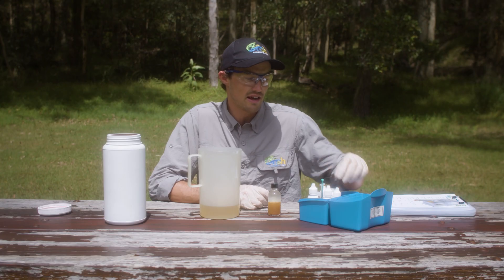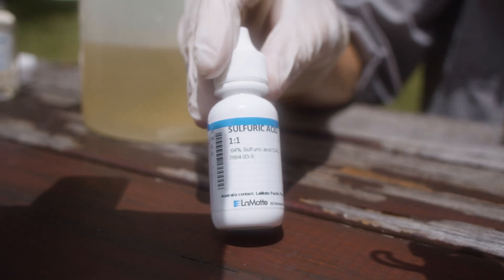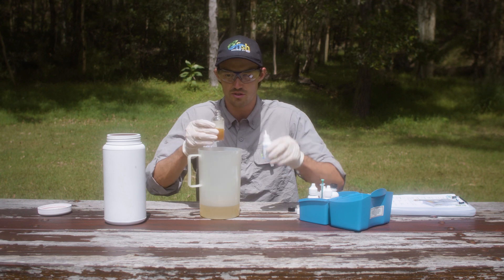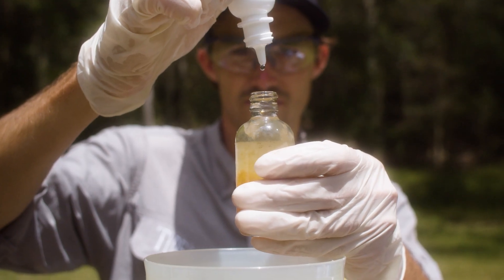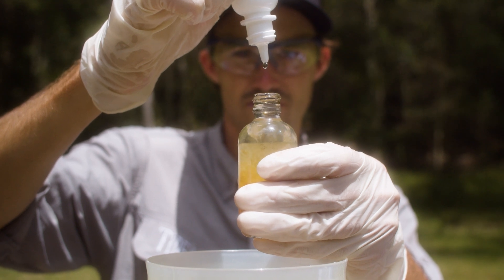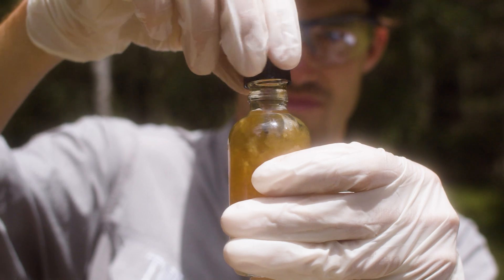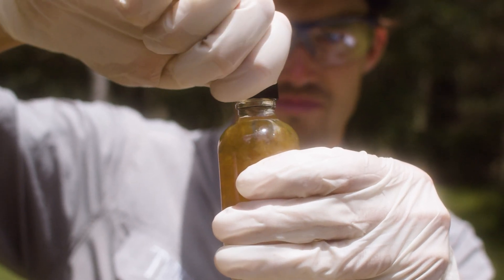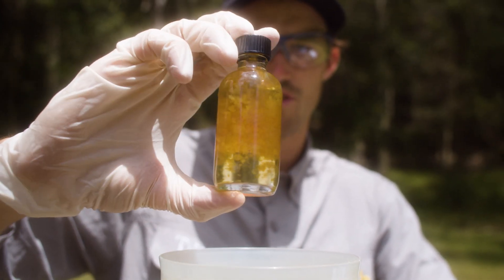Once the sample has settled, get out the next reagent — the sulphuric acid — so just be careful because this is the nasty one. Take the caps off both and add another eight drops, doing it over the waste container and keeping the dropper 100% vertical. Put the cap back on and keep inverting until all the precipitate is dissolved and the solution is a pale or dark yellow.